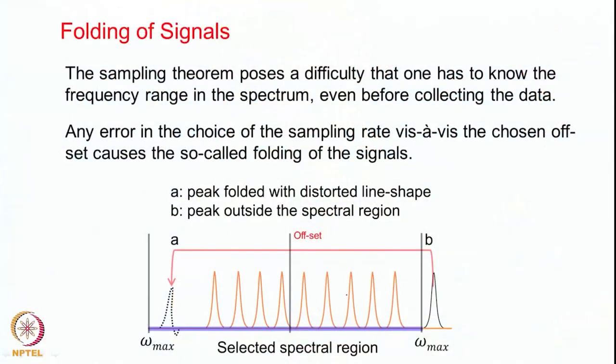The sampling theorem therefore poses a difficulty: one has to know the frequency range in the spectrum even before collecting the data — where to place the offset, what is the spectral range, and what is the maximum frequency with respect to the offset. This is not easy to know. What happens as a consequence is that some artifacts appear in your spectrum, and this is shown in this particular slide in a pictured way.